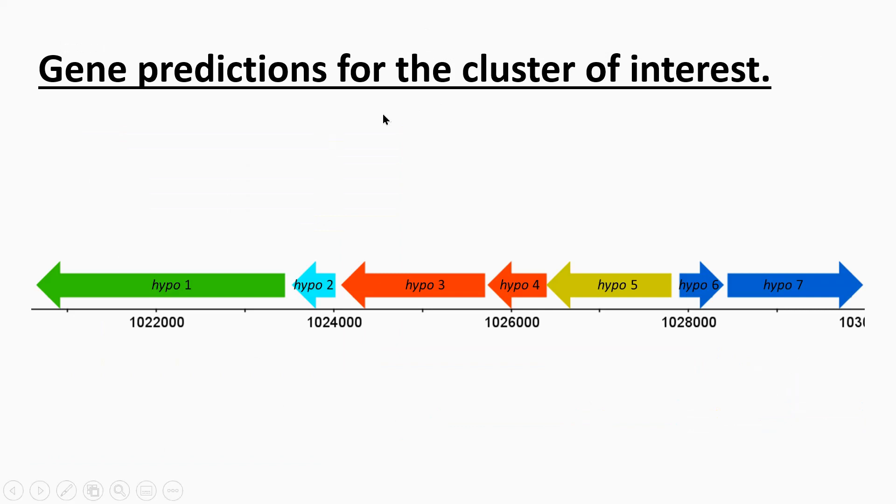Moving on. Gene predictions for the cluster of interest. So overall I've shown all seven of those genes. I'm actually interested particularly in these two.